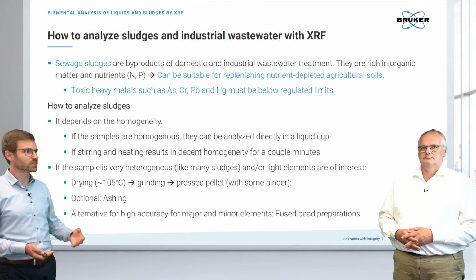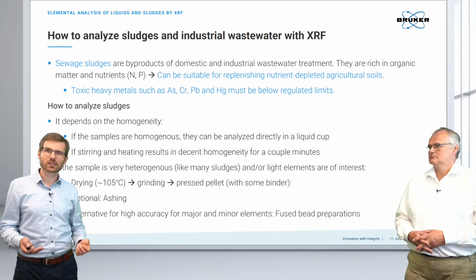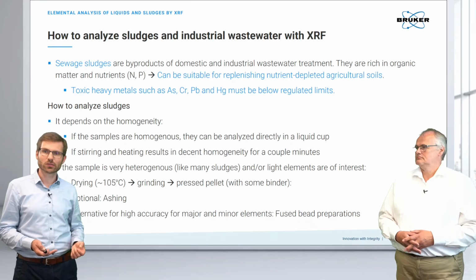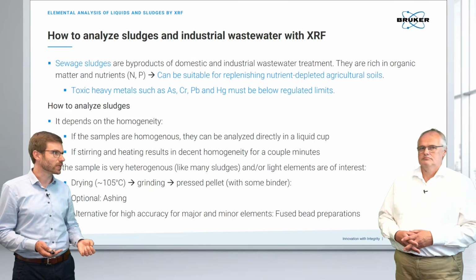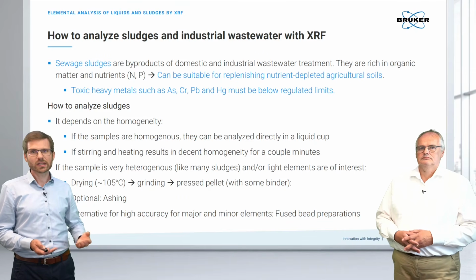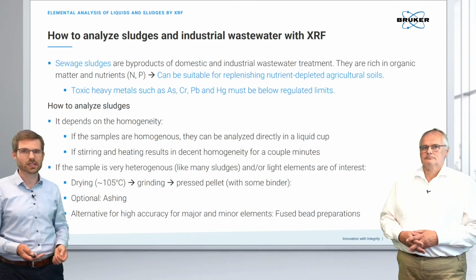Oftentimes it can be quite sufficient to simply load it into a liquid cup. But in most cases, when you talk about sludges, industrial wastewater, recycling, you would dry the material, grind it and press it into a pellet before measurement. In rare cases, you might also fuse it for better precision and accuracy for the major and minor elements.